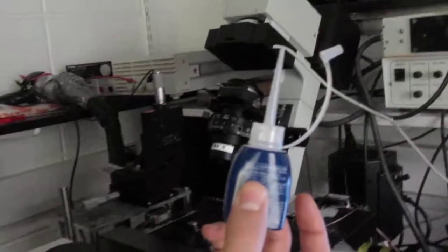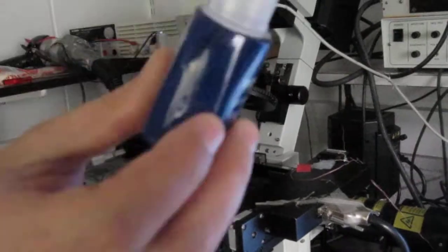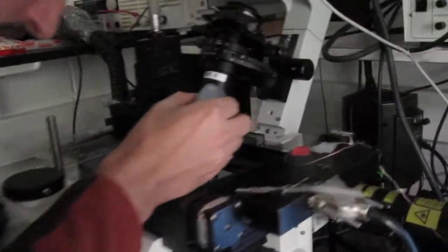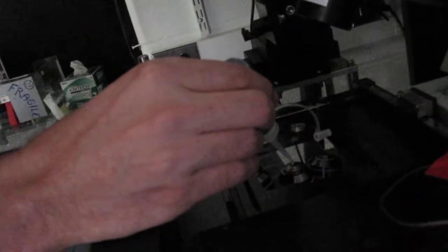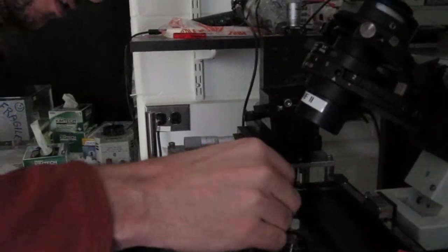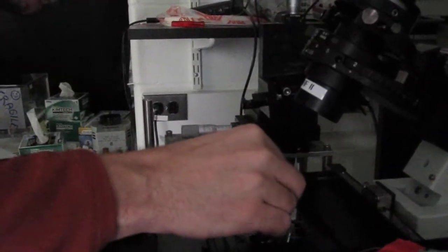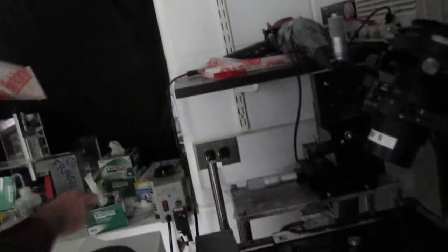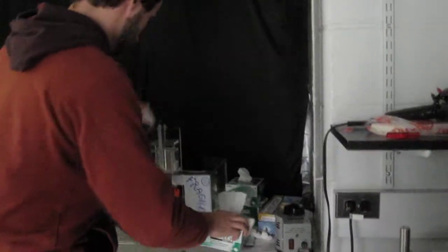Here's the oil. So the way to do it is you first leave a drop out somewhere else like that. You get rid of any possible dirt, and then you put one drop on your objective, and then you would put the sample on top. And now we don't really have a sample, so we're just going to wipe it out. That's what you would do at the end. You wipe this with one of those Berkshire wipes, not a standard Kim wipe, which would damage the objective.